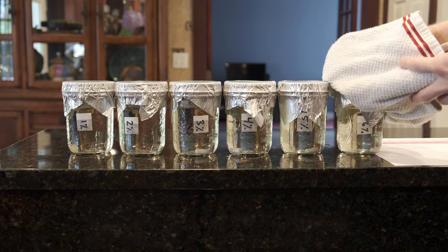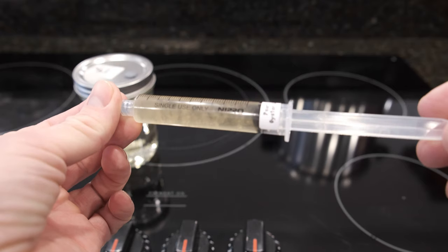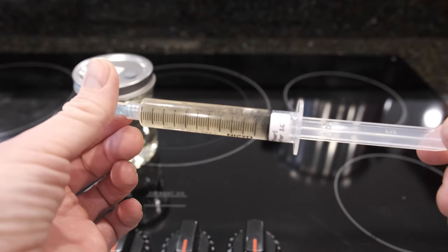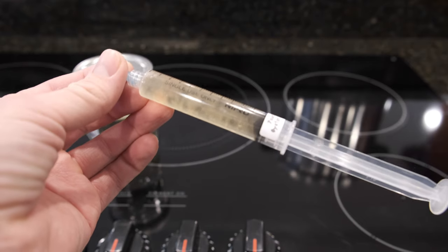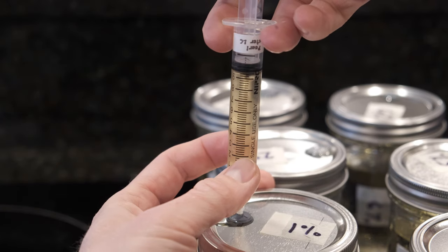Next I got my pressure cooker ready by adding some water to the bottom, placing all of the jars on the trivets, and then pressure cooking at 15 psi for 15 minutes to sterilize. Cooling it overnight. For this experiment I'm using a liquid culture from my friend over at Mushroom Man Mycology — this is where I get my liquid cultures, spores, and prints, and if I'm ever trying to get new genetics, this is my go-to source.